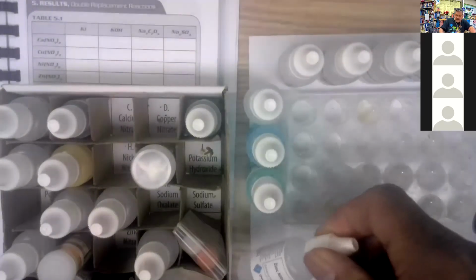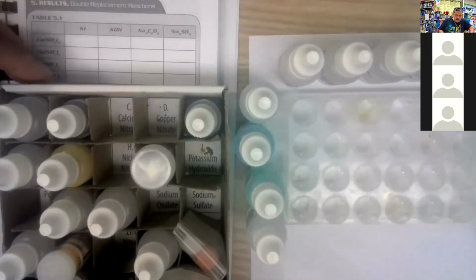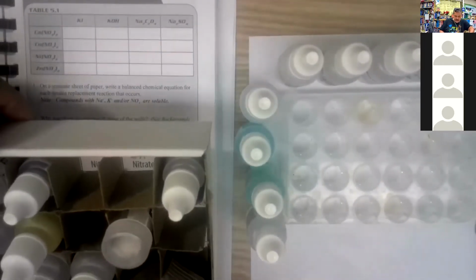I'm going to shake these up while I check them. Zinc nitrate, good. Nickel nitrate, yep. Copper nitrate, for sure. Calcium nitrate, looks good. All right, so I'm going to move my chemical box out of the way. And you can see what I was talking about at the bottom of the box. They have labels, but those aren't that helpful when you're trying to find the actual one. It's helpful when you're putting it away.